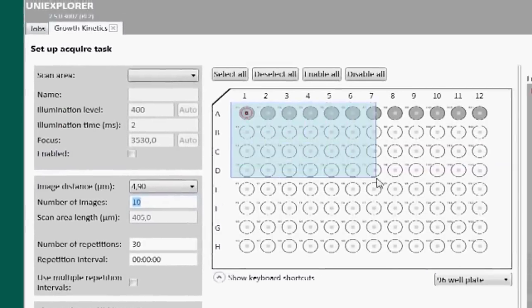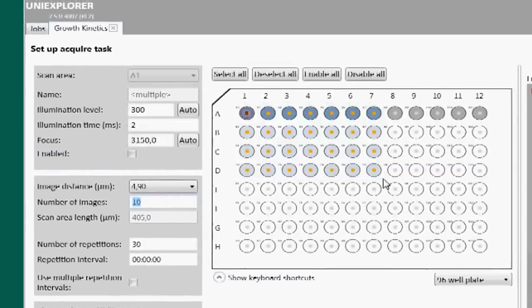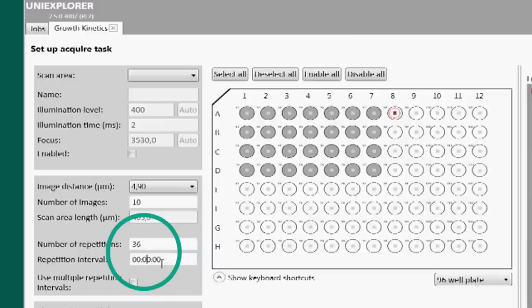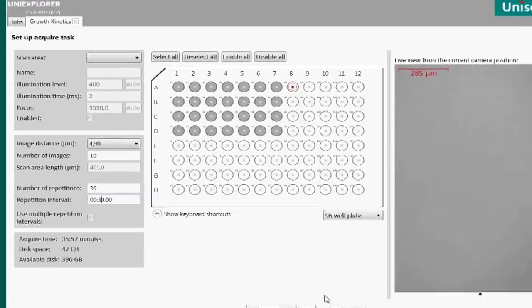Finally, the individual wells that are to be analyzed are chosen as well as how long the measurement should last and how often the sample should be scanned.